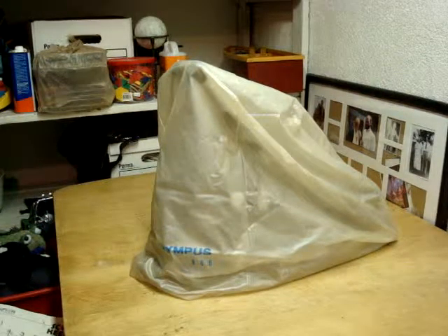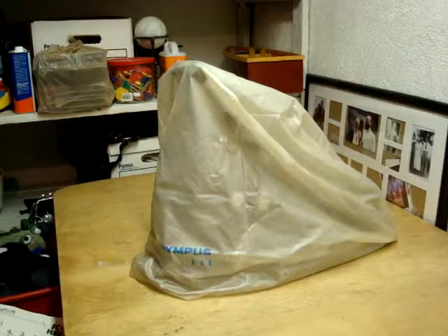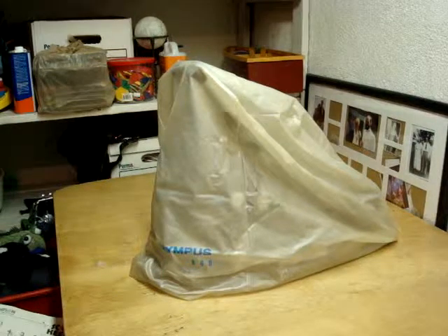Hi, this is Cameron Legg and I'm going to show you a demonstration video on how to use a microscope.